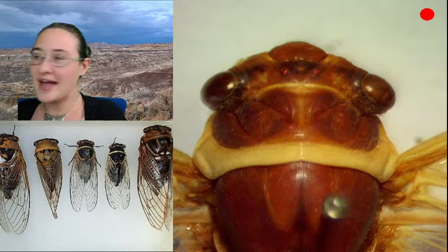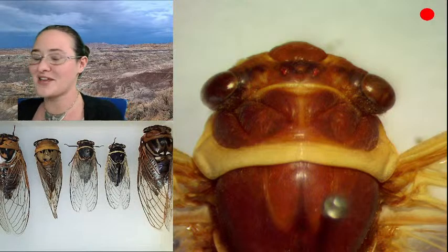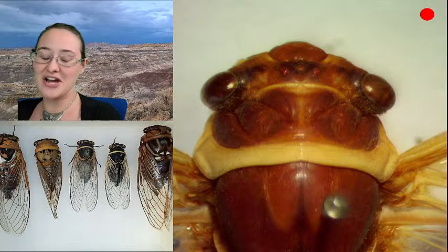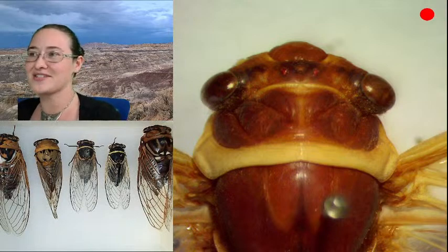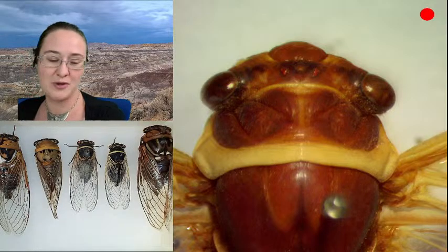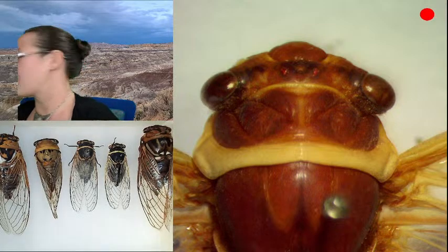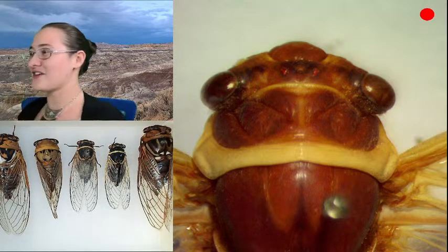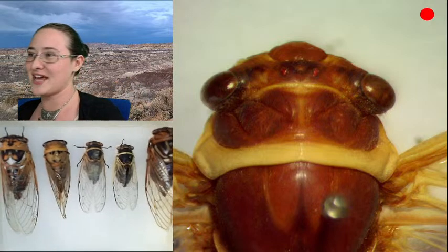So I have a variety of cicadas that I'm looking at here. The one under the microscope is the one I thought we would sketch because its wings are spread. That makes it kind of an interesting guy to sketch out and look at all the wing venation and stuff. I thought that could be really cool. These are just a variety of other cicadas that I figured you guys might want to see before we get started. They come in all different sizes, right?